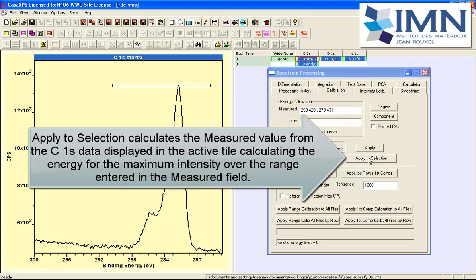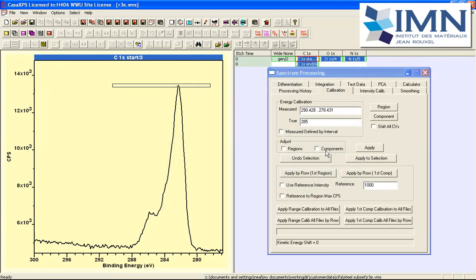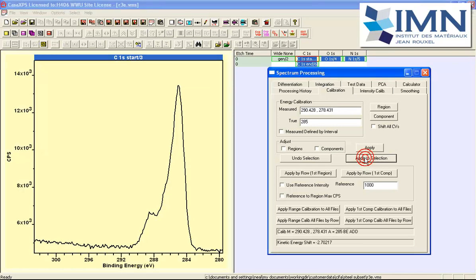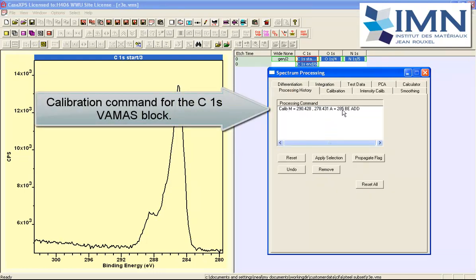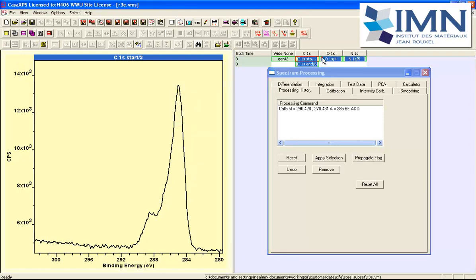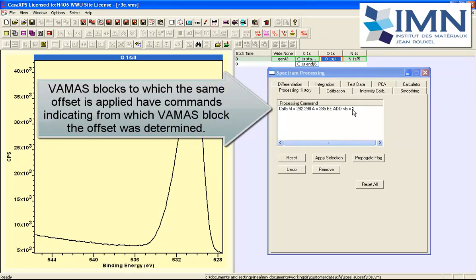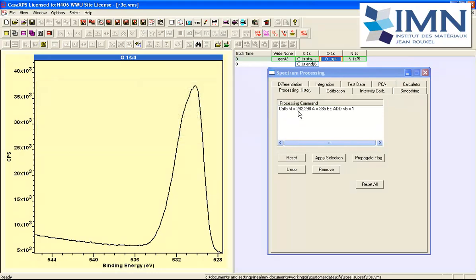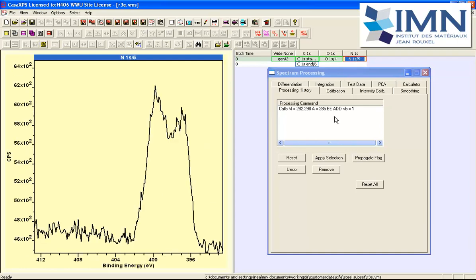We have no regions and no components defined so in this case we don't need to tick those boxes and we just say apply to the selection. The selection is this selection in the right hand side and all of these now receive an instruction that is based on the calculation that's performed on the C1s that's displayed in the active tile. And then we have corresponding commands that indicate the measured that was calculated from the carbon and the actual that was entered on the window and it says that it's from VB equals 1 so this is VAMAS block index 1 where the calculation was performed and has been used in the oxygen and also the nitrogen.